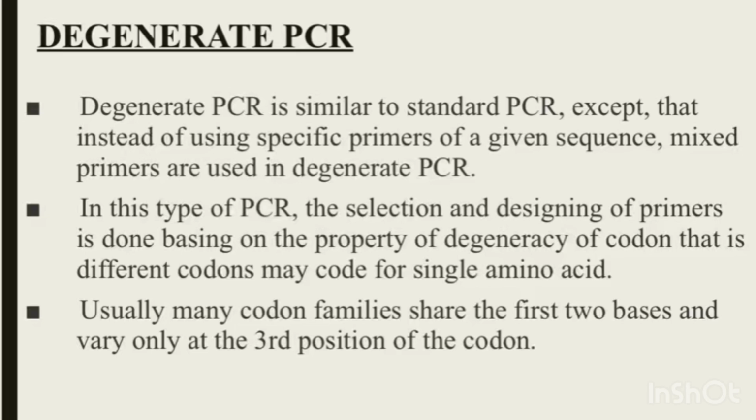So coming to the next PCR is degenerate PCR. Degenerate PCR is very similar to the standard PCR, except that instead of using specific primers of a given sequence, mixed primers are used in degenerate PCR. So that is the only difference as compared with that of standard PCR.